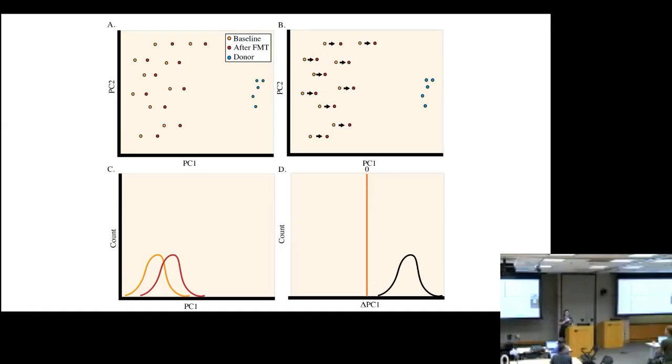That's exactly right. This is really what we were getting at yesterday. There are these high-level tools that we're always starting with, like an ordination. Probably every microbiome paper you read has an ordination plot in it. But until you start thinking about what the specific questions are that you're asking and how to address those directly with this data, for example, using that LME that we did last night and looked at this morning, that's when you start to pull out those answers that are most relevant and most exciting with your data set.